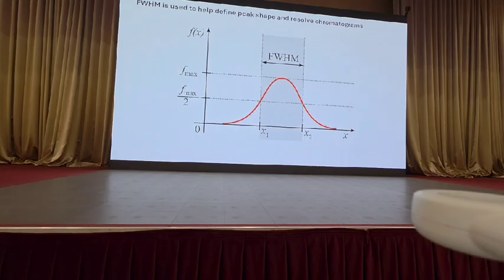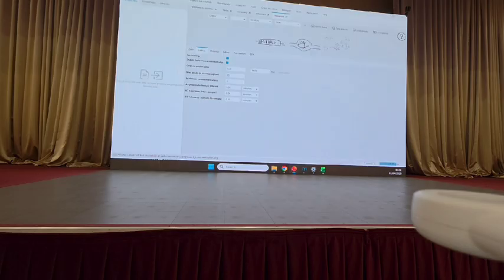So with this information, you can get information about other parameters used in Mzmine without actually having to put it there manually. And in this case, again, default settings work quite well, and we will keep it default.